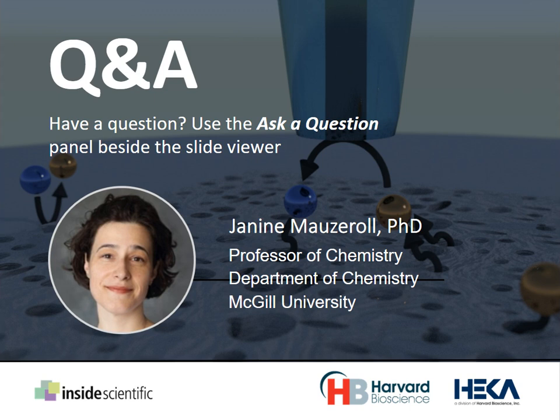Excellent. Great answer. Question here from Daniel, who said, thank you, Janine, for the nice presentation. Have you seen any effect of agglomerated LFP particles versus individual particles from the droplet measurements?